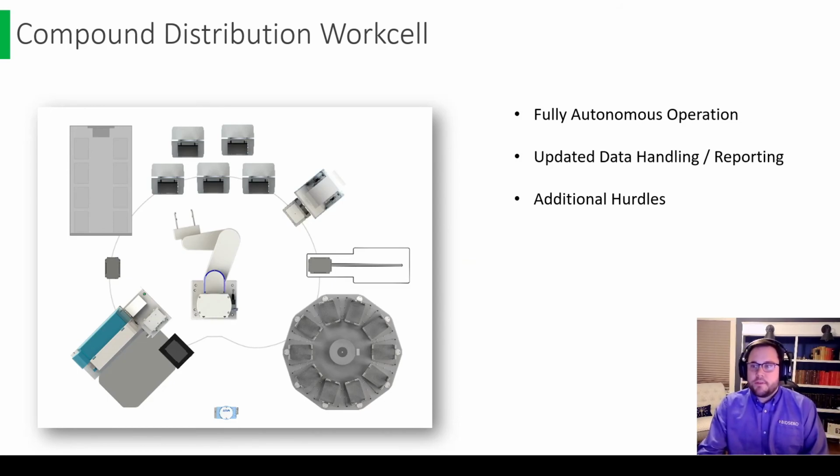But we were able to uncouple this system from the wiring I/O module that was initially present as it was put together. So for both of these, we did have to do a fair bit of rewiring for everything, but at the end of the day, everything's still on GBG, everything's on Windows 10, everything's happy and running, currently, probably as we speak. And I think that's pretty much what I have for now.